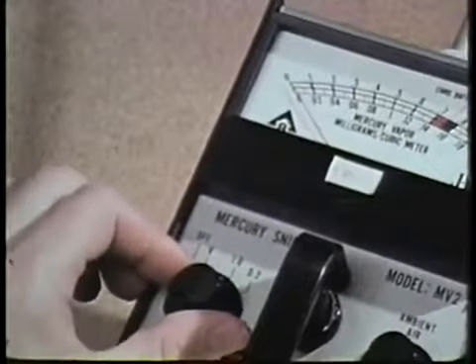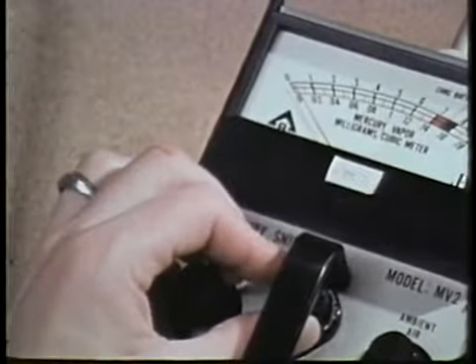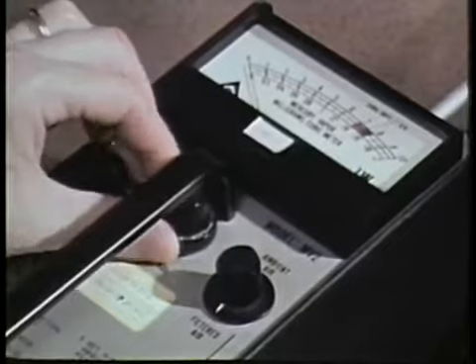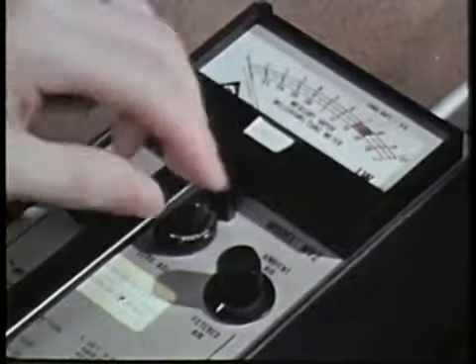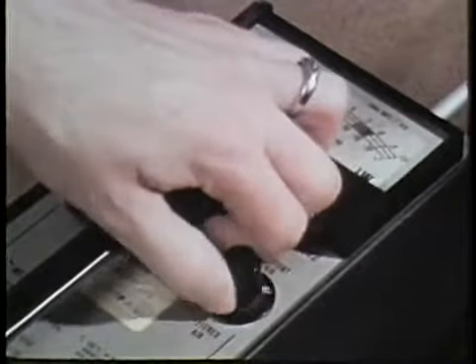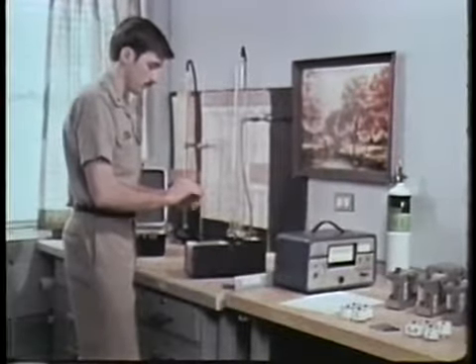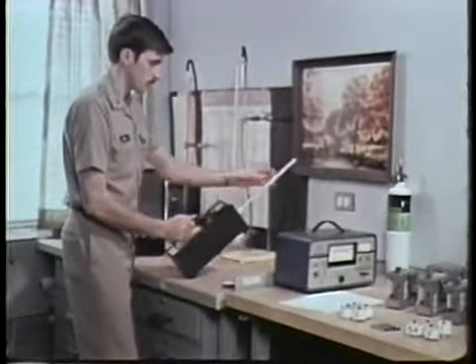Then, switch to the 0.2 scale and zero the meter again. Secure the locking clutch and then shift to the ambient air setting to take a reading. It's recommended that you check the response of the instrument with a sample of mercury, if you have some available.